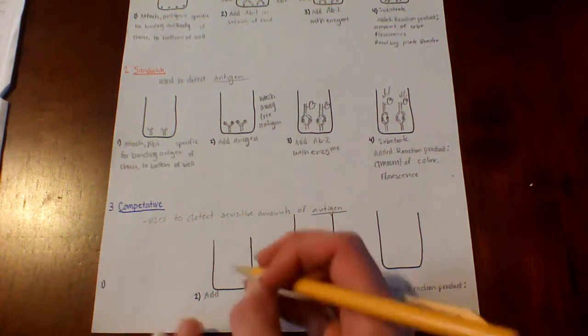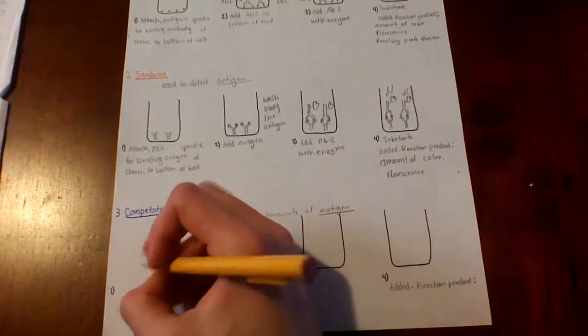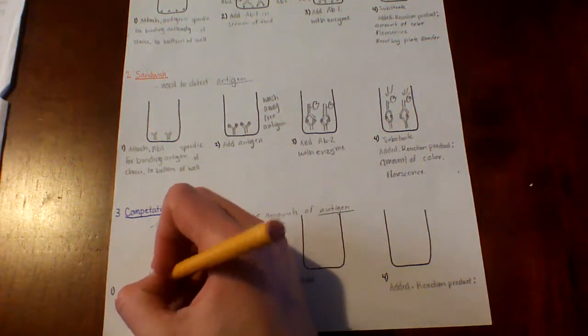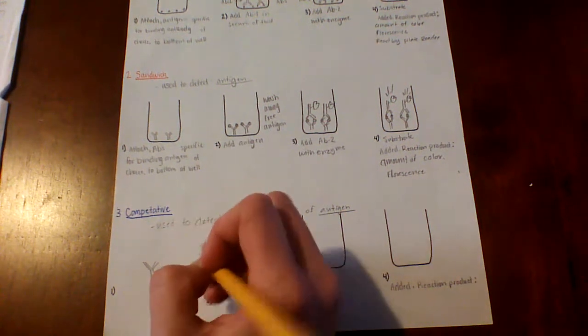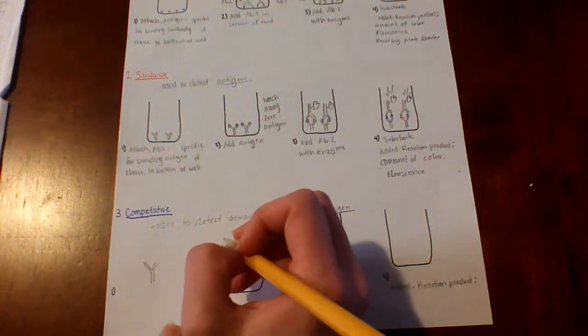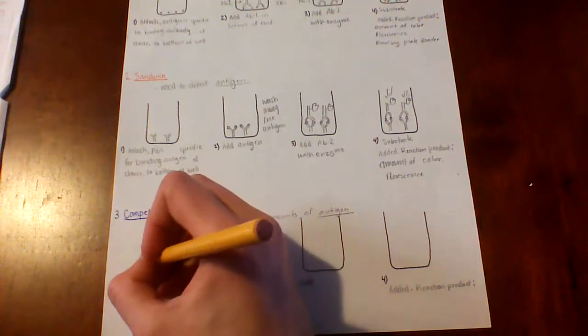So the first step, an antibody is incubated with a solution that has an antigen attached.